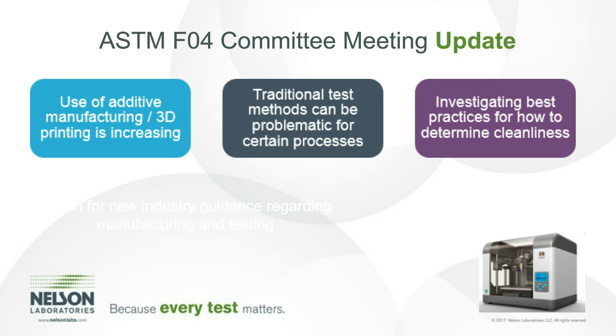So this has got a lot of buzz in the industry right now because this is becoming a more popular manufacturing method in the medical device space. So I would say if you're a manufacturer that works with this type of manufacturing, just stay tuned and know that if you have to assess cleanliness, you might have to work with the lab you're working with to develop the best test plan that's most appropriate for your device.